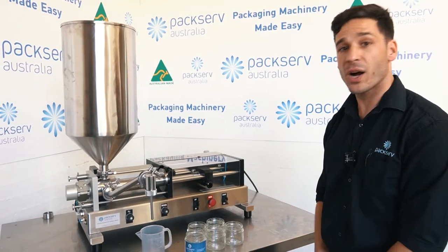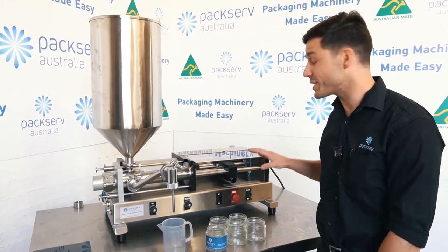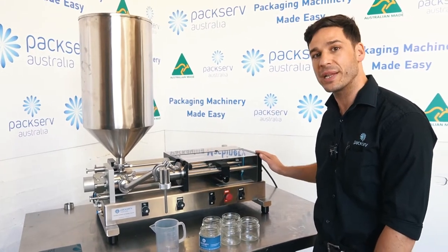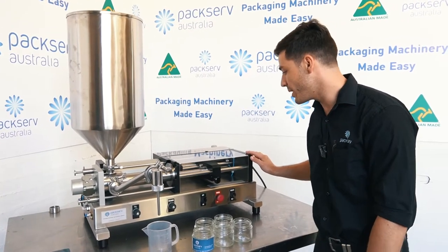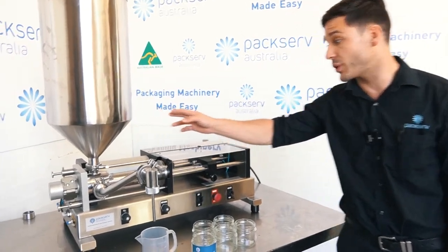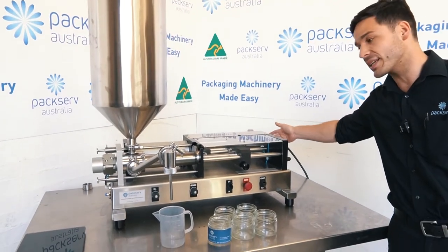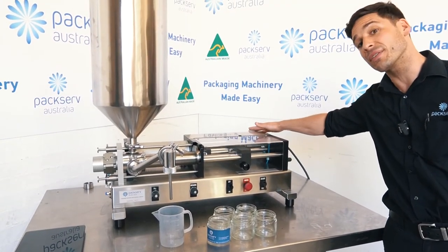Hey guys, Andre here at PacServe. Just going to give you a quick rundown on how to operate, use, and set up the PFM3 Benchtop Semi-Automatic Filler. I've already put some product in here, which in this case is just water with some blue dye. I've got my air connected, turned on, pressure set to five and a half bar right now.